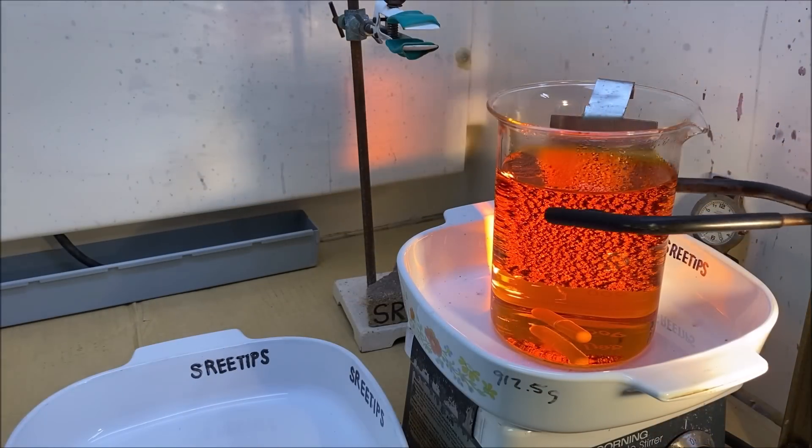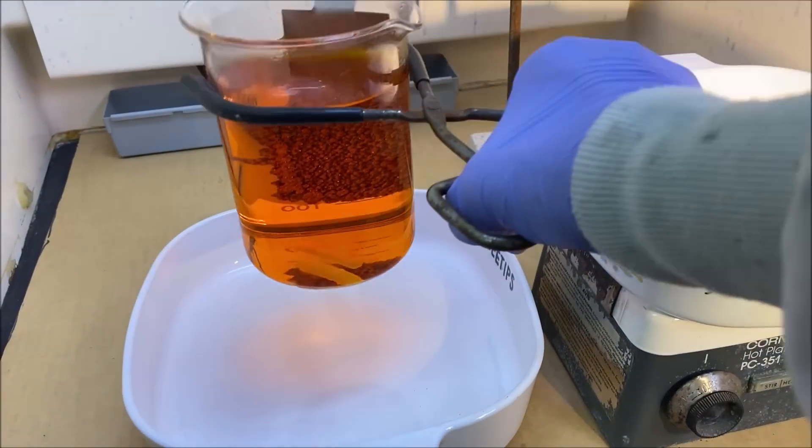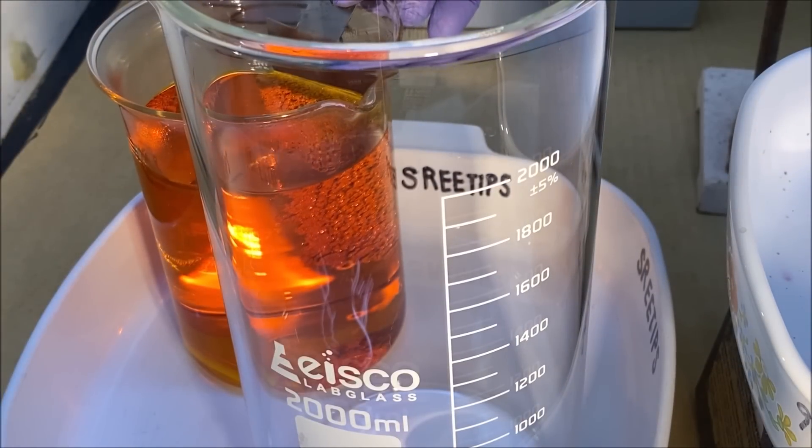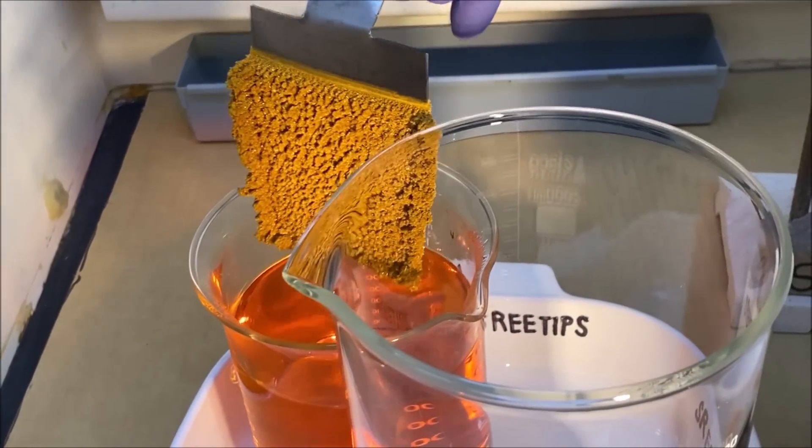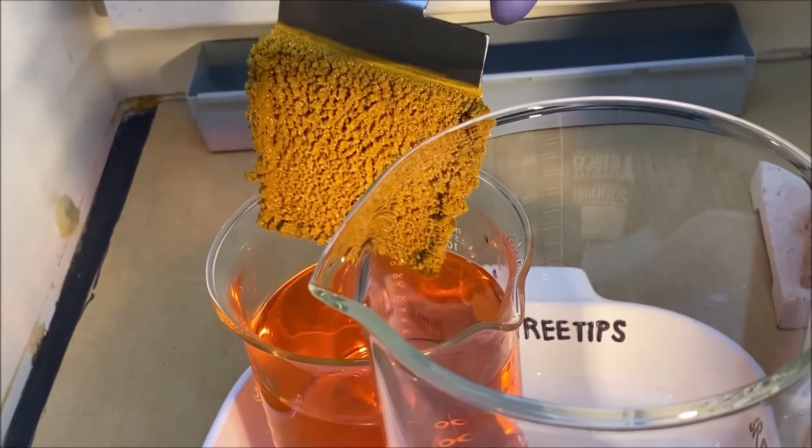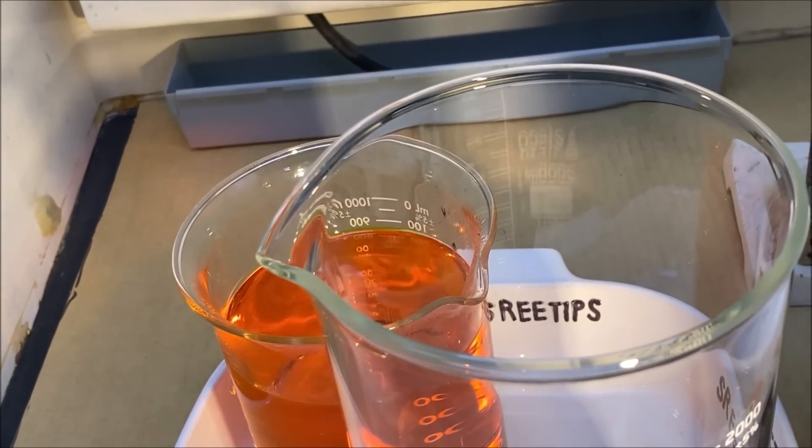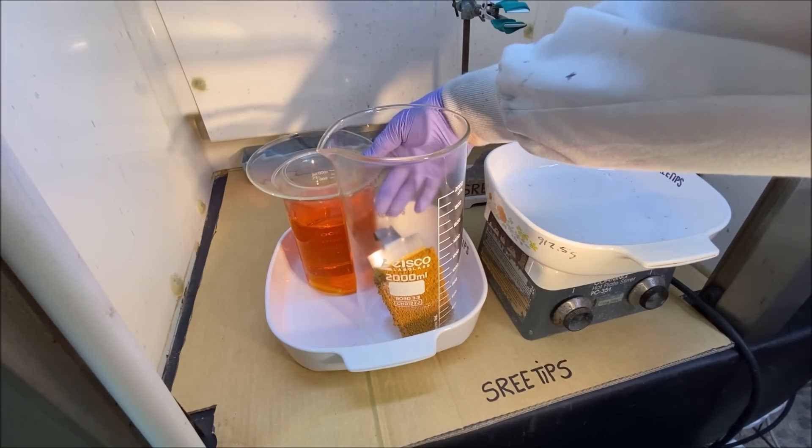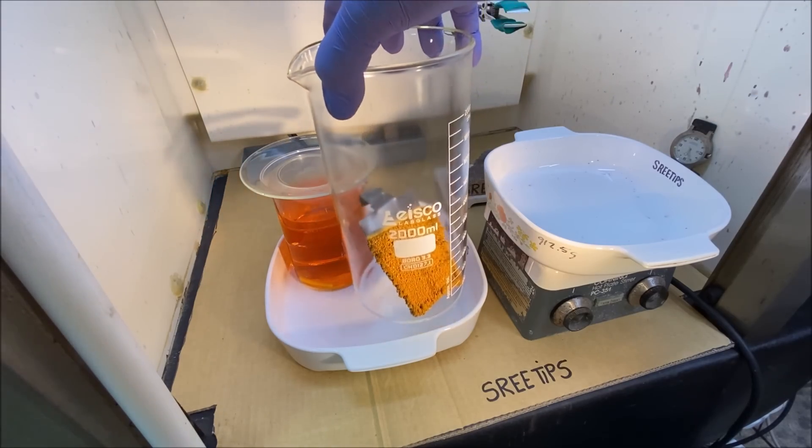I'm going to take our beaker with our gold in it and set it down here out of the way. Let's take our gold cathode and stick it in this beaker. Now we're going to cover up the electrolyte. We can recover the gold from that. This orange liquid is going to have a bunch of gold in it.